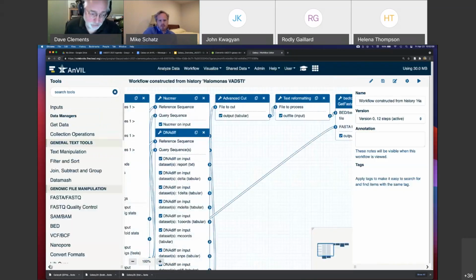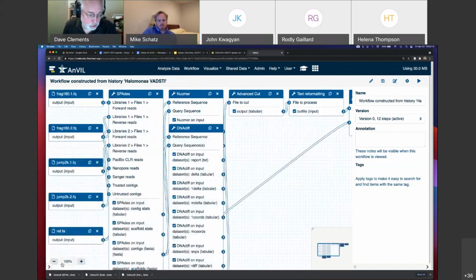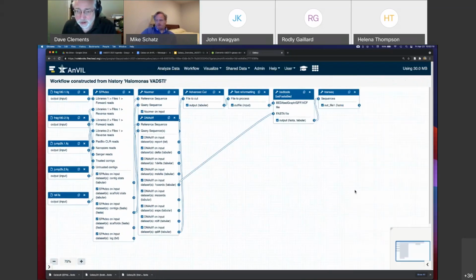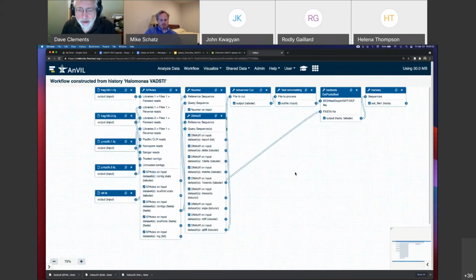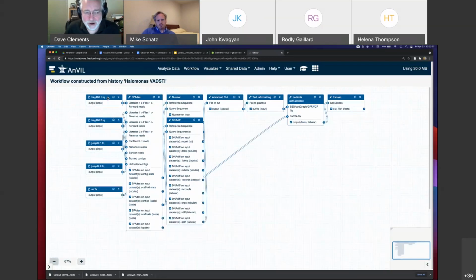Okay. So let's see, and I'm going to shrink my zoom some so I can actually see everything. And I'm going to minimize this. So what I clicked on there was edit my workflow. Okay, and up this comes, and I will admit that this initial rendering does not offer us a lot more insight than we had from that stack in the history. But what we can do is rearrange things here. And I'm going to do one more zoom out. And so what I've got over here are my 5 inputs, the ref, the paired end, I'm going to do that.